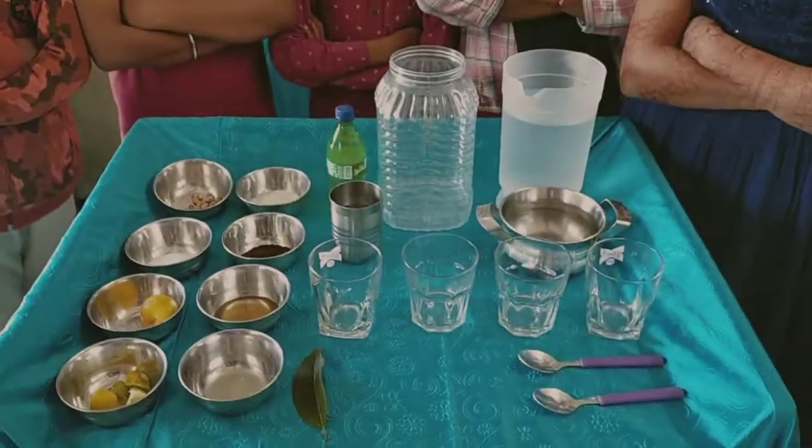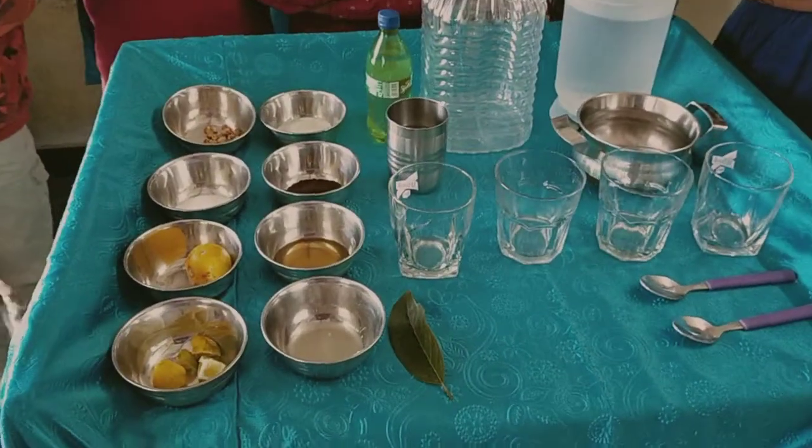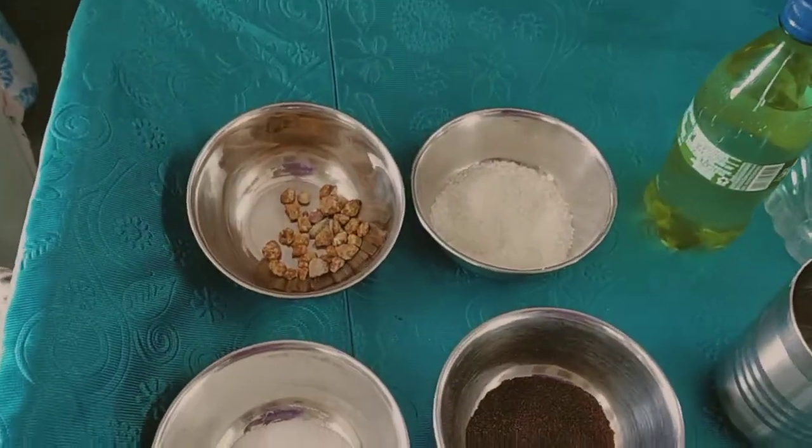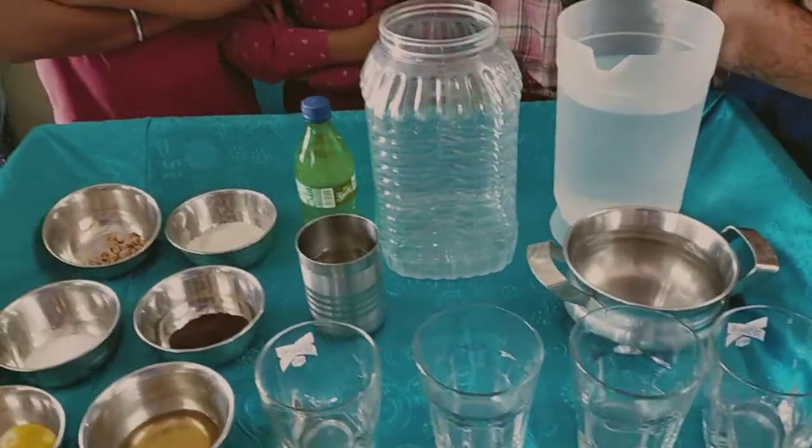You can think that it is our small chemistry lab. See what all things we have on this table. I'll explain you one by one all these things. So our topic today is regarding solubility.